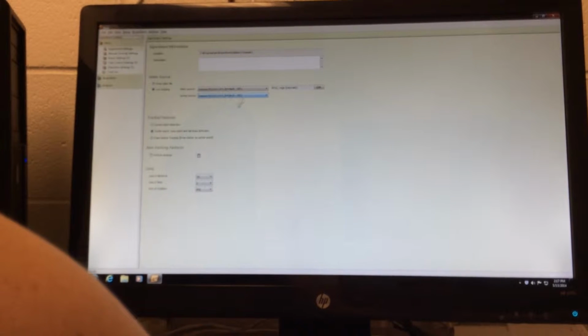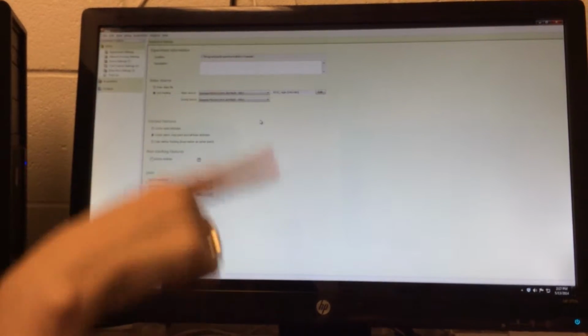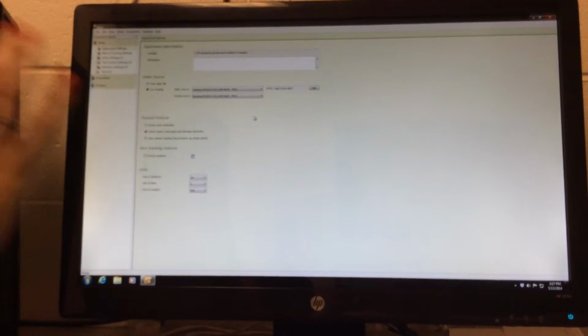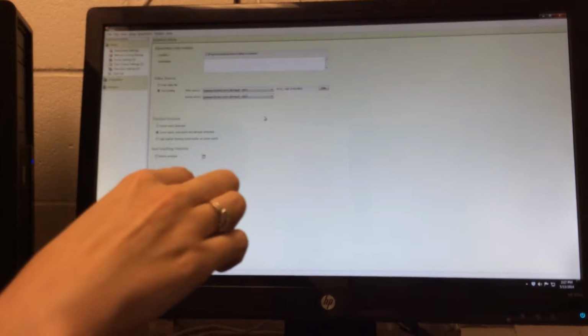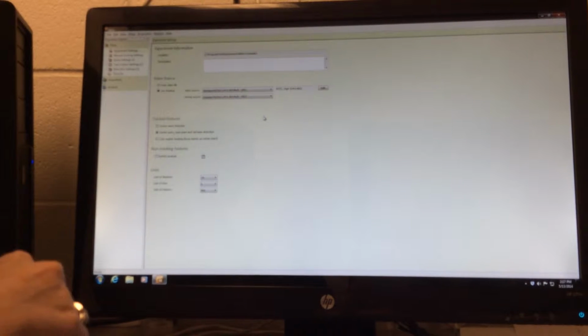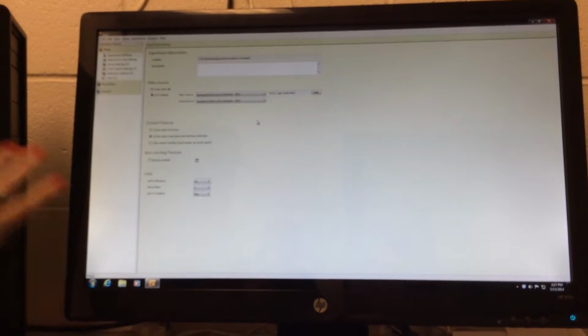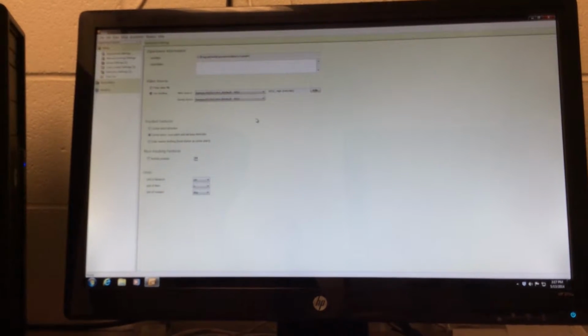If you have saved video, you can always pull in the videos that you acquired already and rerun them in the new experiment with the 3-point tracking. So the video is separate from what's being tracked. The track that you'll see is just overlaying on top of the video. The video can always be retracked. You could pull in a video from 5 years ago and track it as long as it's compatible. That doesn't matter. And you can track a video as many times as you want to.